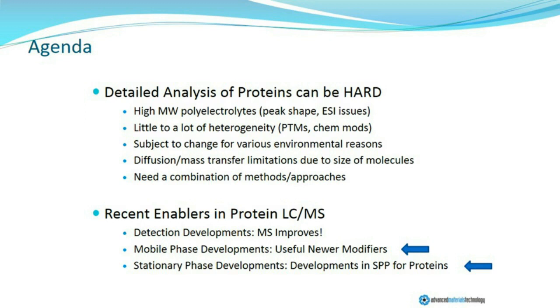So when we think about where the major improvements have been in protein analytics, certainly the rise and continuing popularity of LC methods coupled with mass spectrometry is amongst the first things that I think of. In terms of mass spectroscopic instrumentation, there's been massive improvements, particularly during the last couple decades. We won't really discuss a great deal of that today, but we can certainly assume that as we look several years out, we'll be talking about even greater capabilities in mass spectrometry.